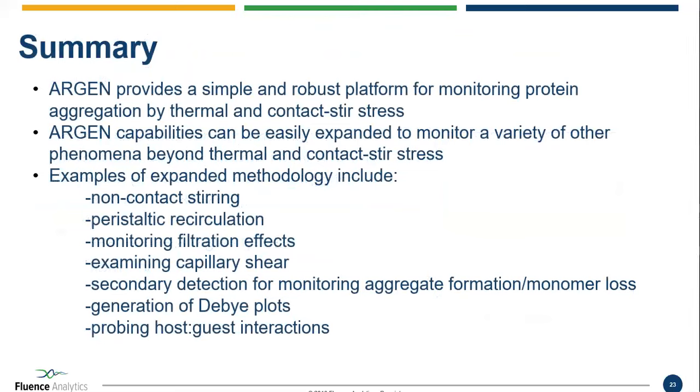A small amount of equipment, a little bit of setup, and you can start looking at things like non-contact shear, all of those things. And I'm sure there are other things that I didn't touch on in the talk that people can think of to do.